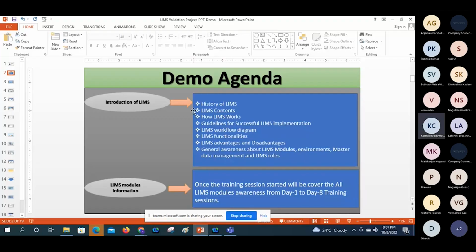What is the history of LIMS? What are the LIMS contents? How does LIMS work?